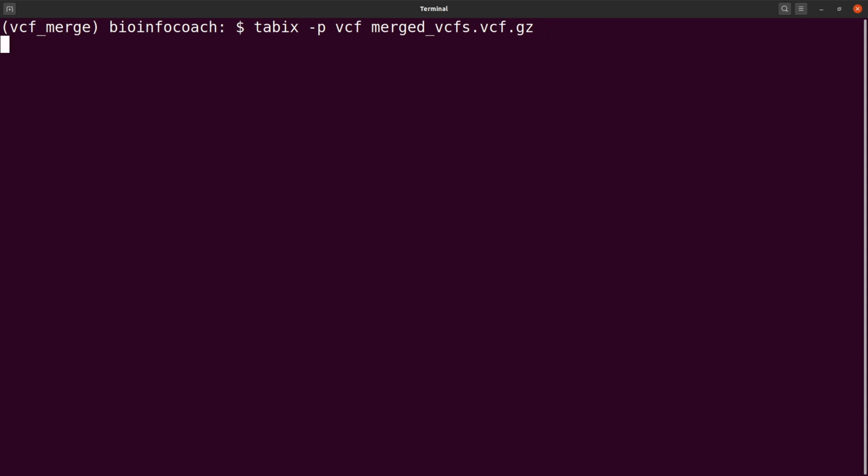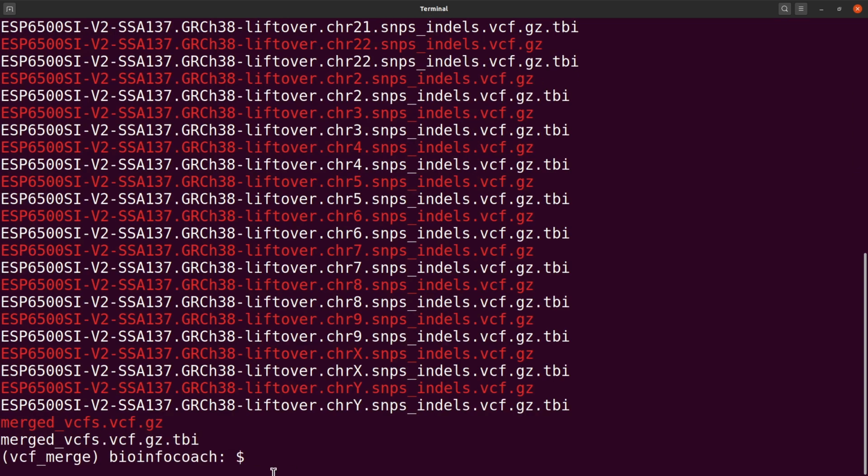So we do it here. So we wait for the indexing of the VCF to also be done. So now it's done. So let's do ls, and you will see that it is also here for us.